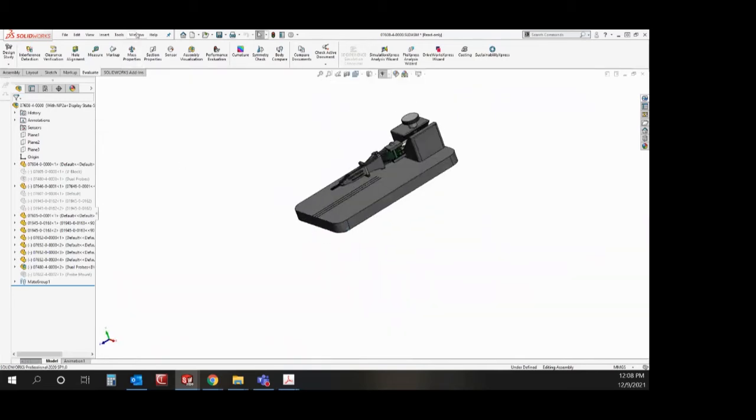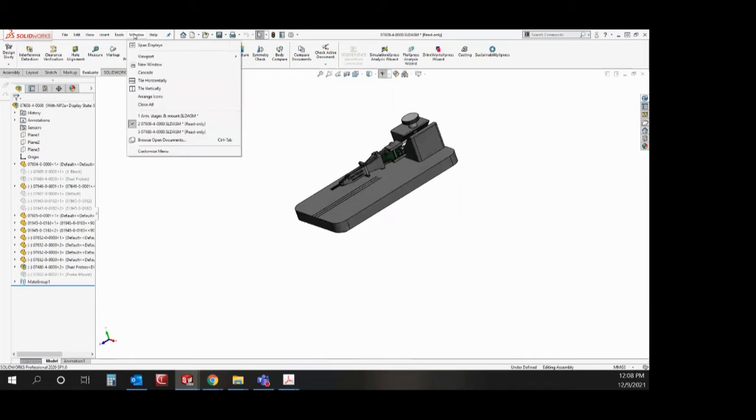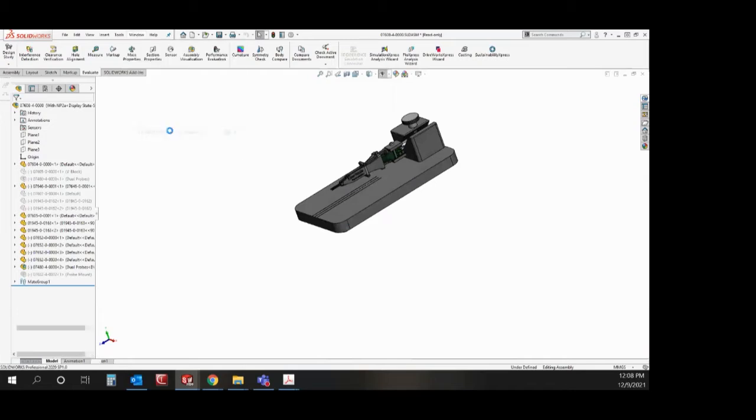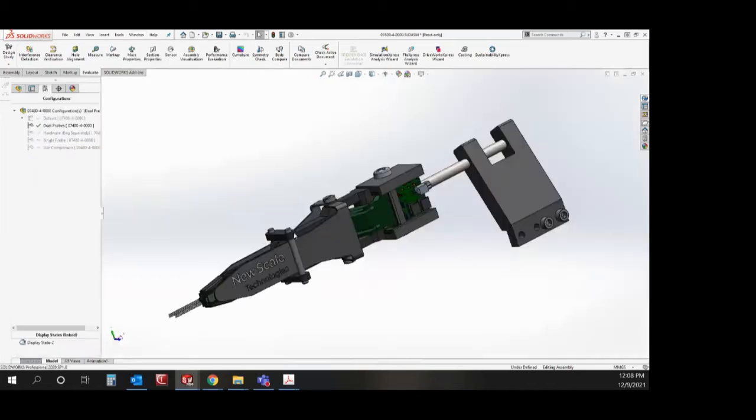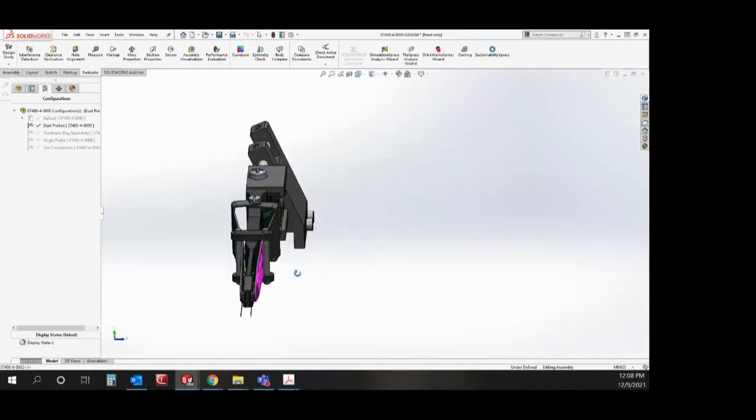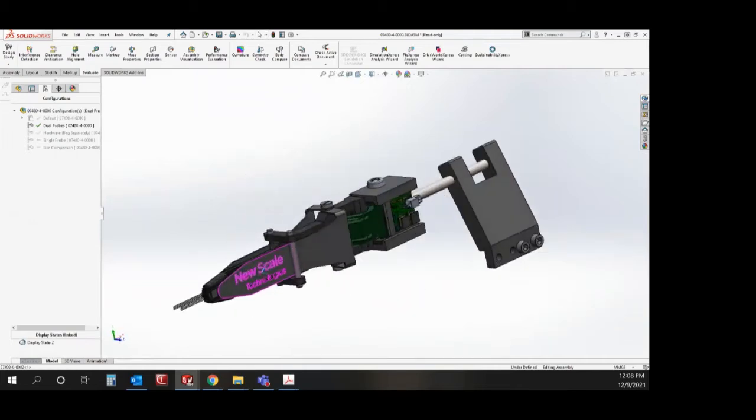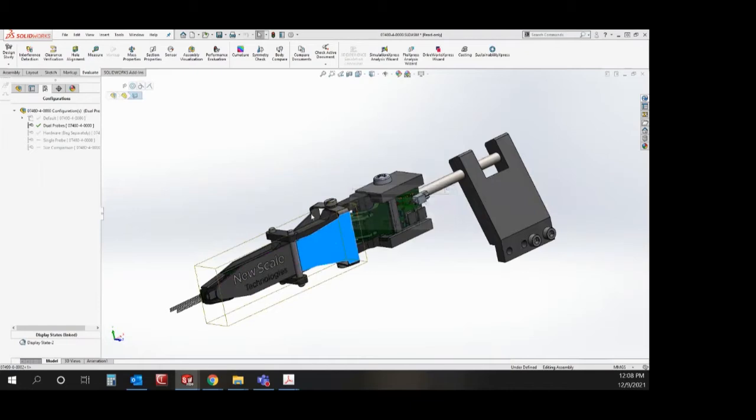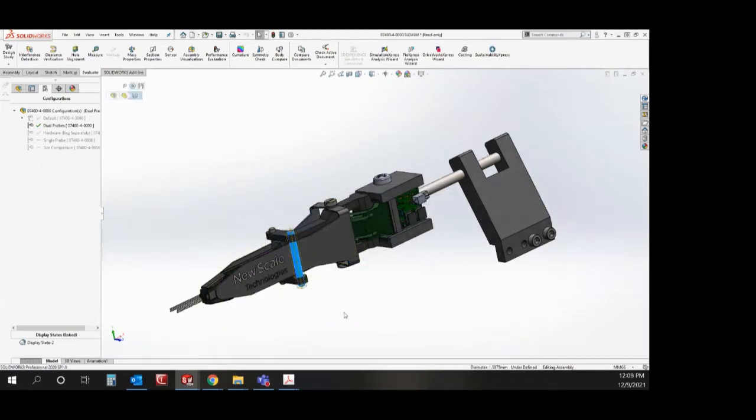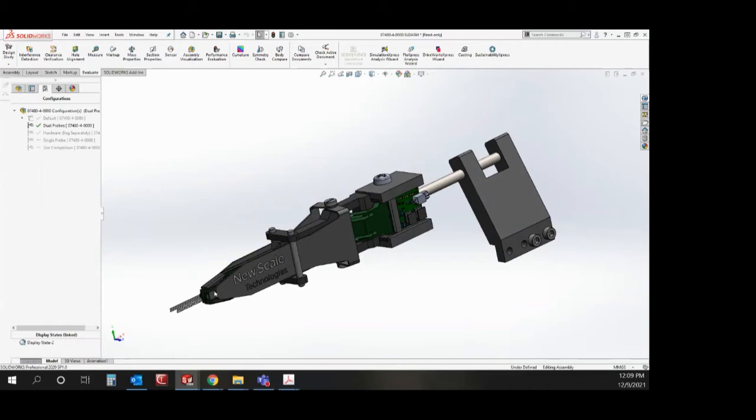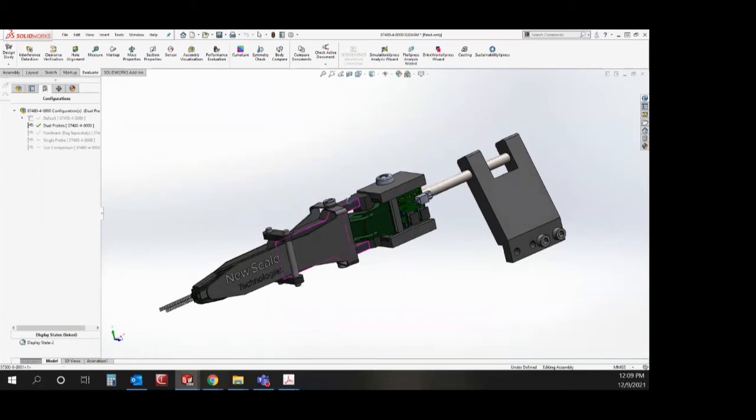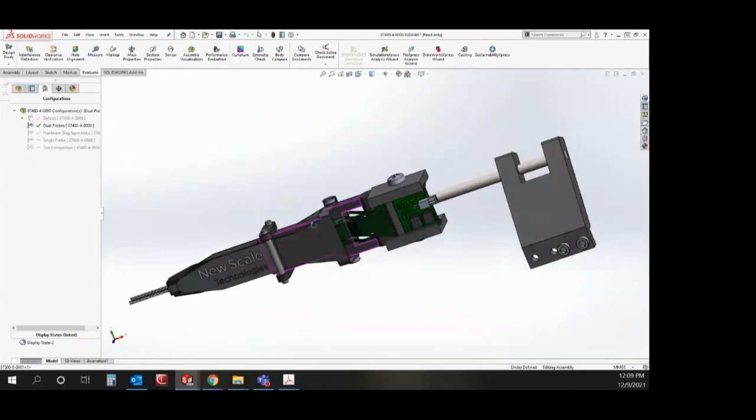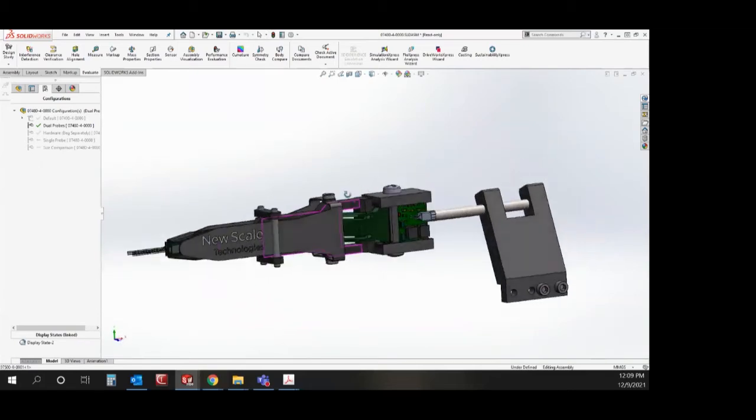So I'll talk a little bit about the probe mount itself here. For our probe mount we have sheet metal clamps to help hold the probes in place. We have retaining pins that can be inserted and removed to aid in keeping the sheet metal clamps with a force on the tip of approximately two newtons. This will allow the probe to stay in place during insertion.